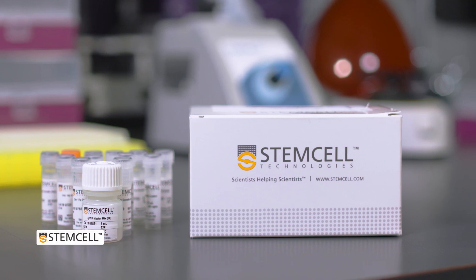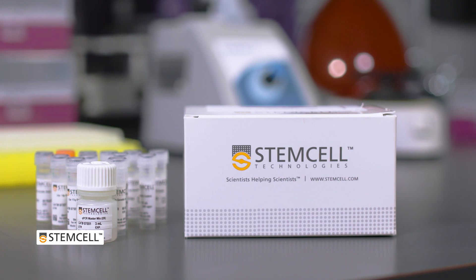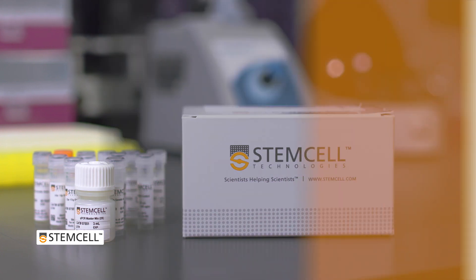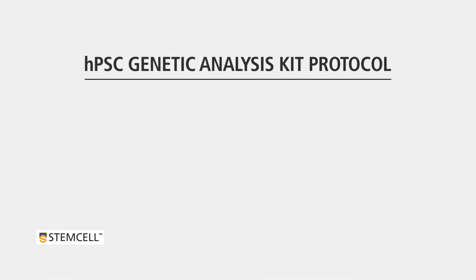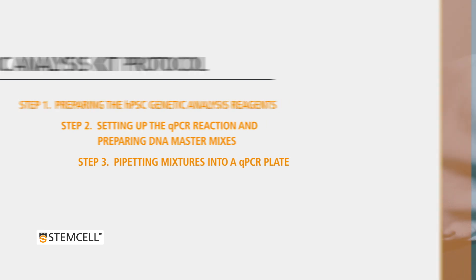Let us guide you through the protocol for analyzing genomic DNA samples using the hPSC genetic analysis kit. This video will provide step-by-step instructions for preparing the hPSC genetic analysis reagents, setting up the qPCR reaction and preparing DNA master mixes, and pipetting mixtures into a qPCR plate.